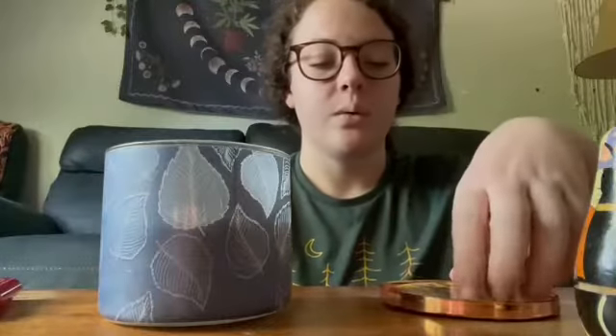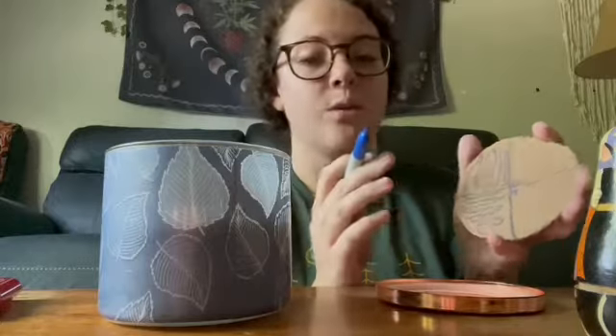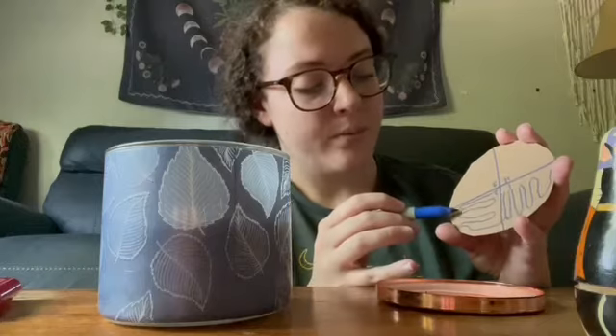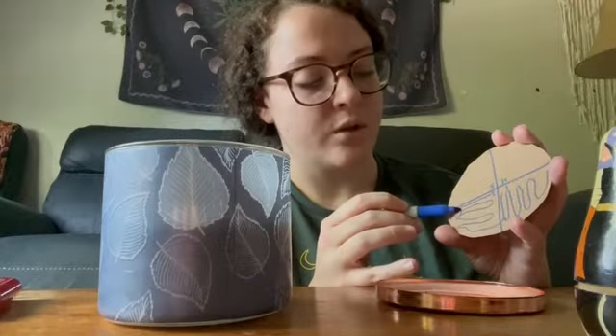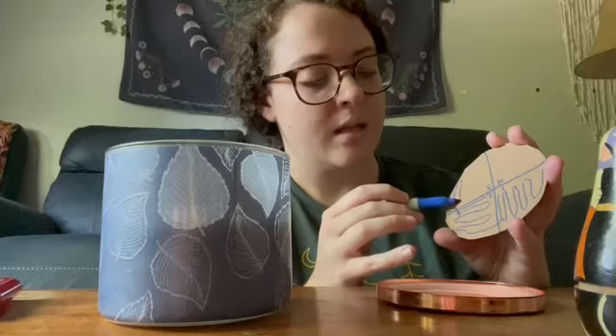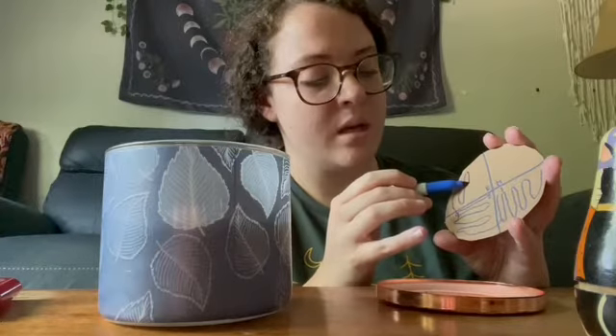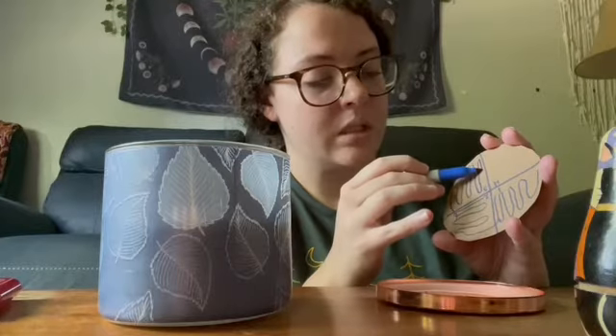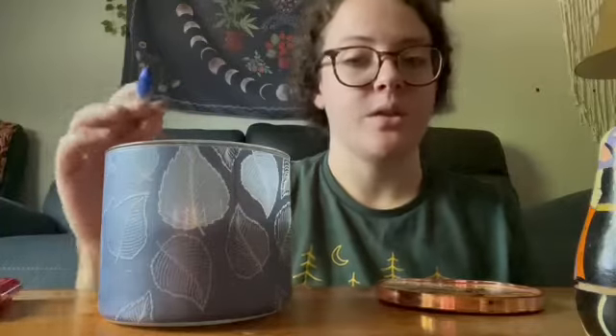Next you pick up the agar plate again after your inoculating loop has cooled, turn it another 90 degrees, swipe one or two times through quadrant two just to get some of the sample, and then swipe into quadrant three doing it the same way as with the other two quadrants. Then put that back down and flame your inoculating loop again to sterilize it.